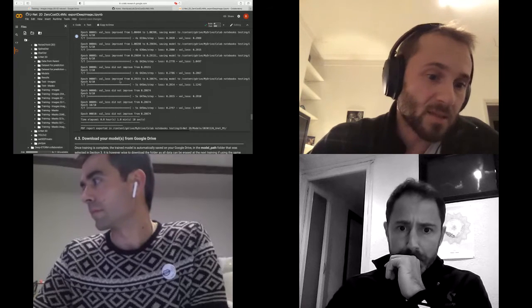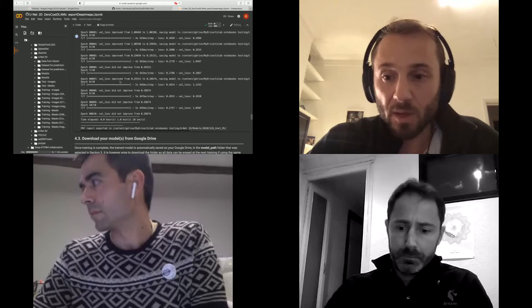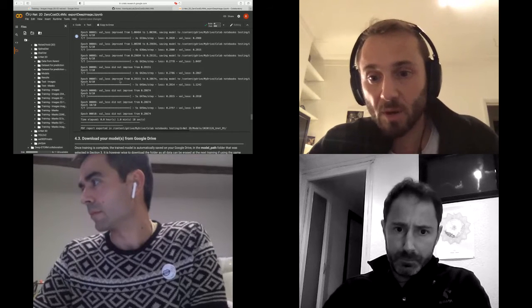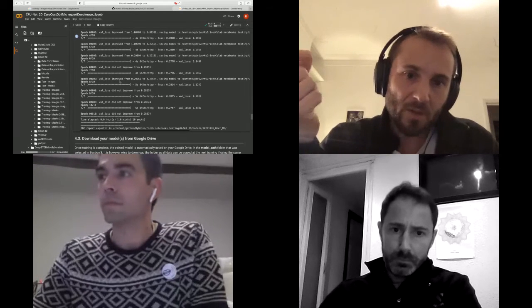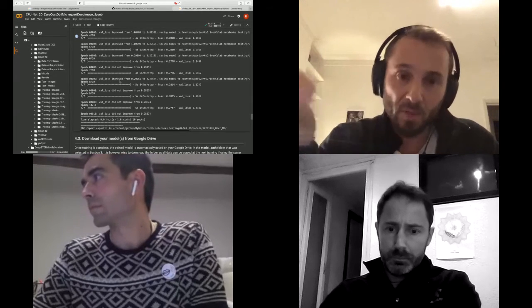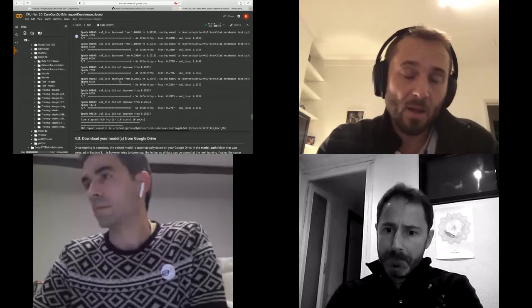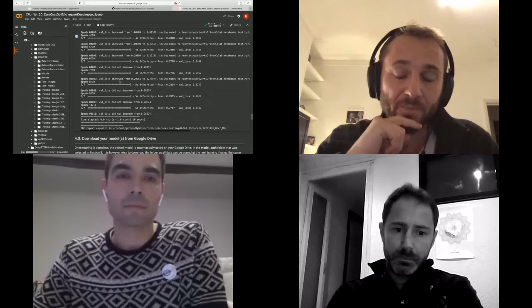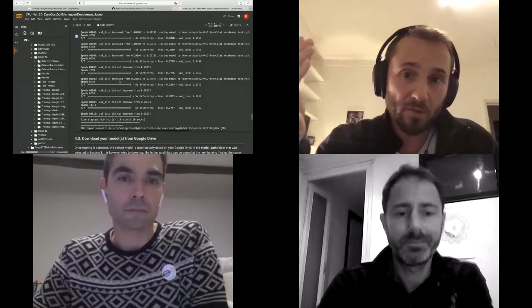But in the case of the example that I've shown you earlier, going from actin network to DAPI network, generating the ground truth data set isn't a big hassle because it's simply throwing some DAPI staining on LifeAct expressing cells, and then acquiring a bunch of two-color images.